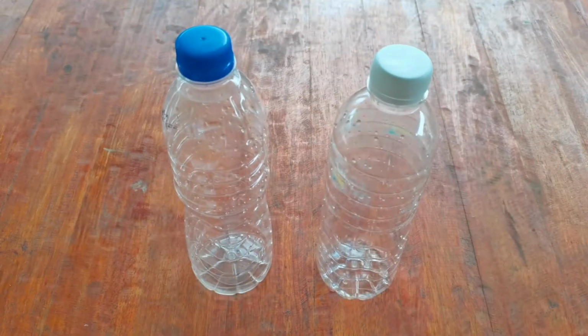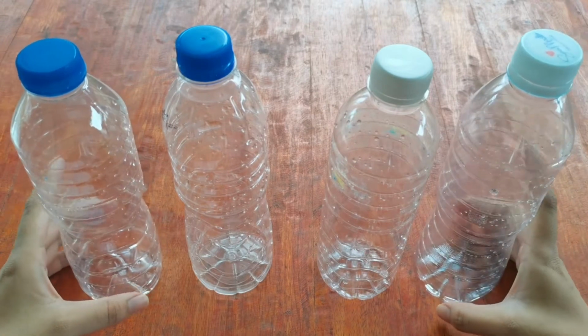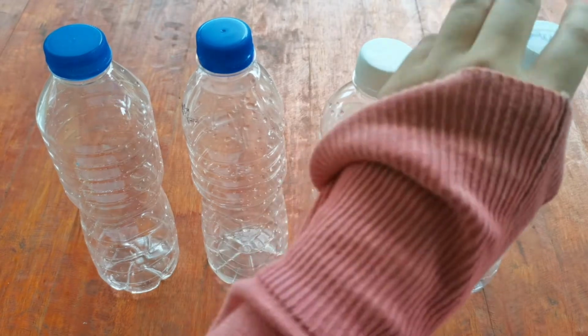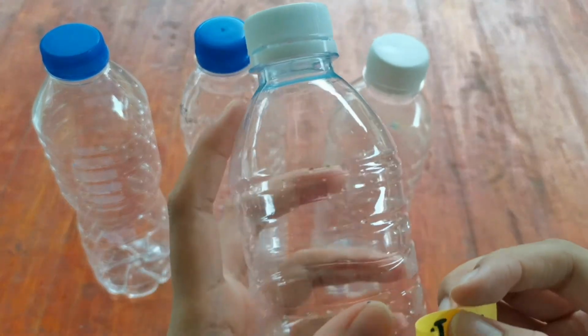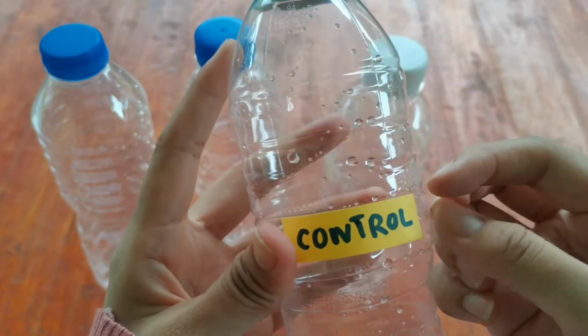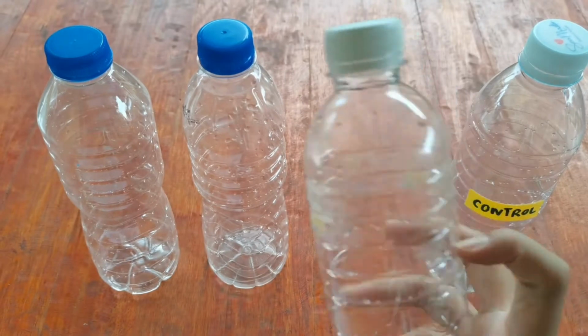Firstly, you have to prepare 4 empty plastic bottles. Label all the empty plastic bottles with glucose, table sugar, cornstarch, and control.